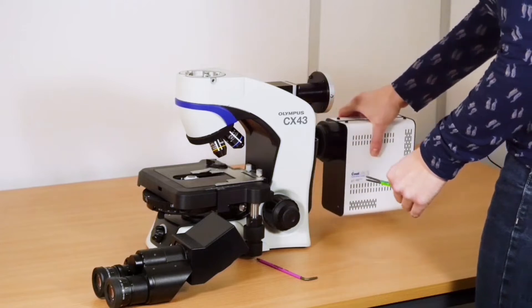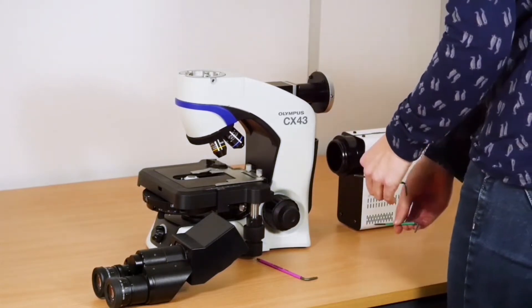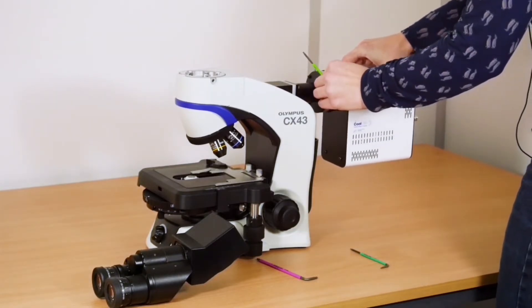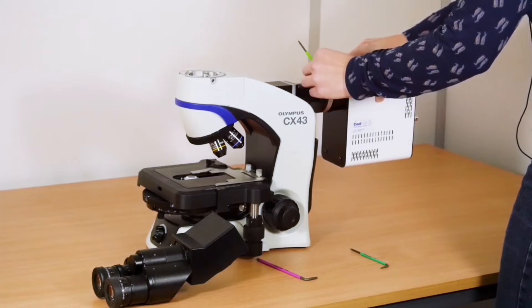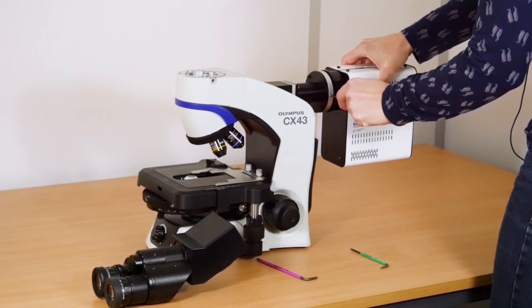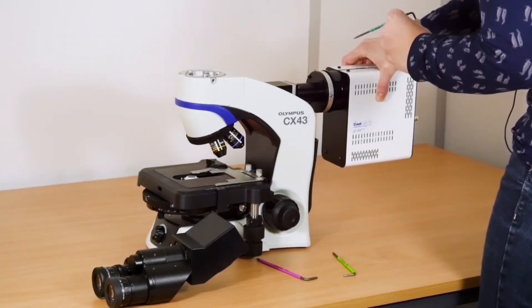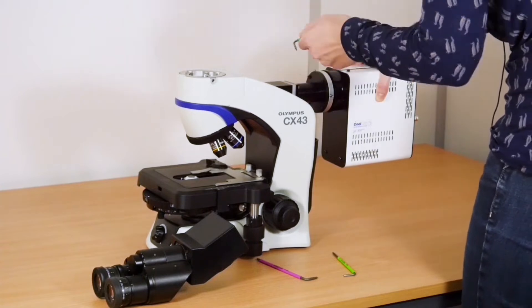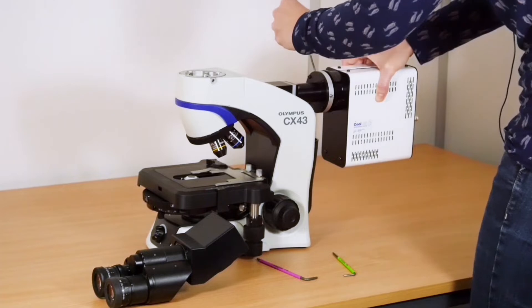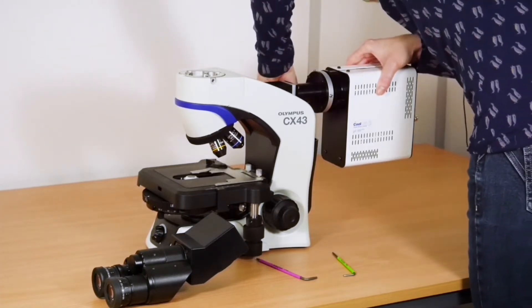This uses two different sizes of grub screw, so you need a 2 and a 2.5 hex key. Simply attach that. Loosely tighten the grub screw one at a time. There's also another grub screw this size at the back.